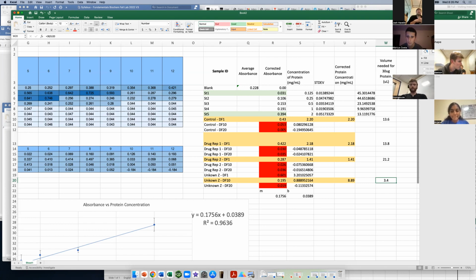We did this in the spring, and it didn't happen. So it wasn't supposed to happen. And 2 out of the 4 groups Tuesday morning didn't have it happen at all. So I don't know. I fixed the data though, so you guys can also analyze it as is with the fixed data. That's biochemistry in action basically. And like I said, in the real world, you would just redo this. All right, thank you. Yep.